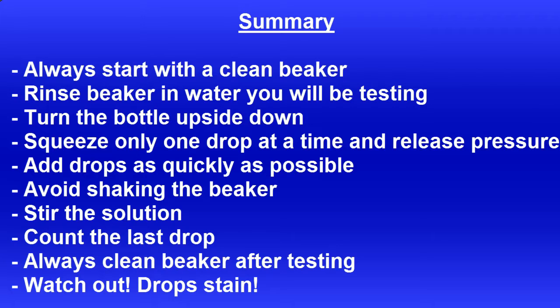Now when you add drops, you'll want to turn the bottle completely upside down. Squeeze until one drop exits, then release the pressure. Repeat that procedure for each drop that you add.